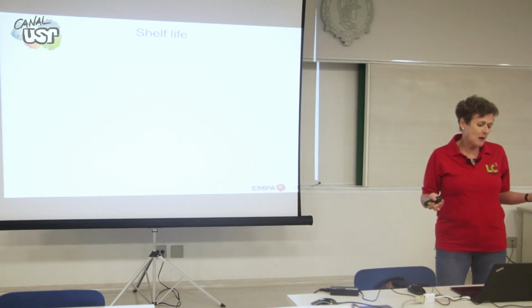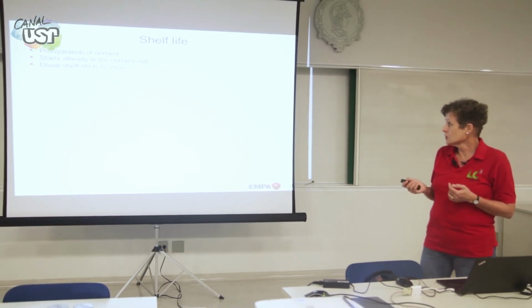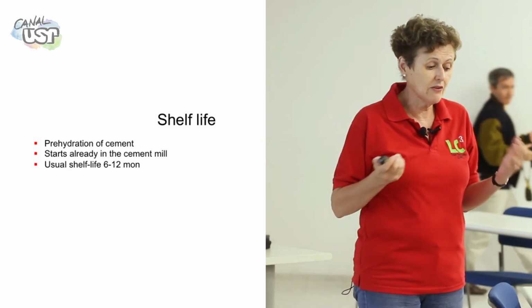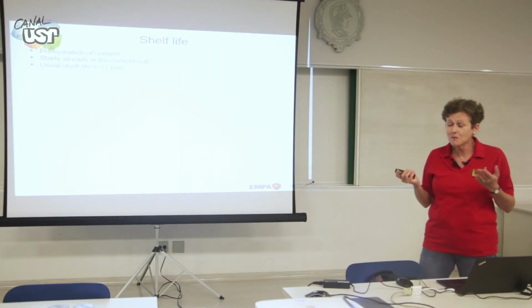And the first point they make, which is another very general, very important point, is to understand about the shelf life of cement. Many people, when they're starting out on a PhD, get a batch of cement, spend a lot of time characterizing it, and after about 1 or 2 years, they think, oh, I should have done that experiment. They go back to the same lot of cement, but the problem is it's not the same lot of cement. Usually you can only rely on a cement being more or less stable for as little as 6 months. And if you live in a hot country with a high relative humidity like Brazil, it may be a lot less than that.